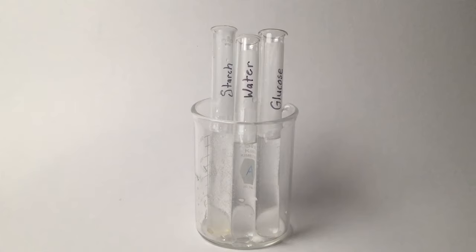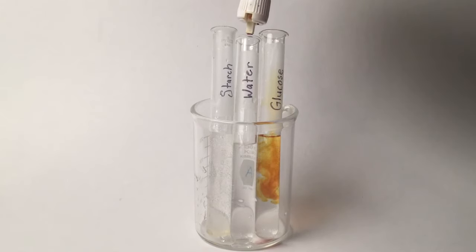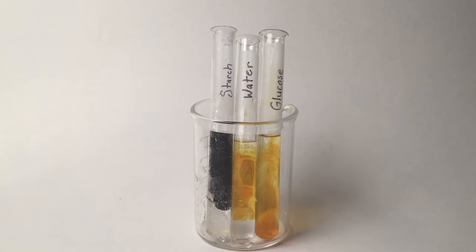My next test is for starch and I will use iodine for that. In the glucose solution with iodine, I get an amber color. With water, I get an amber color which both indicates a negative test but starch turns a black, purplish, bluish color, leading to a positive test.